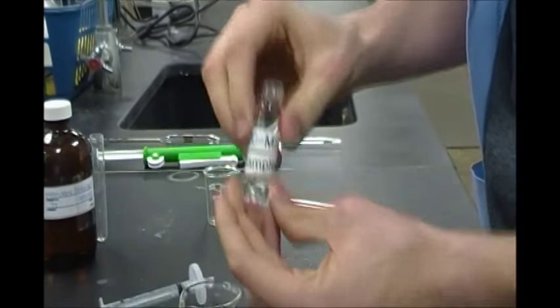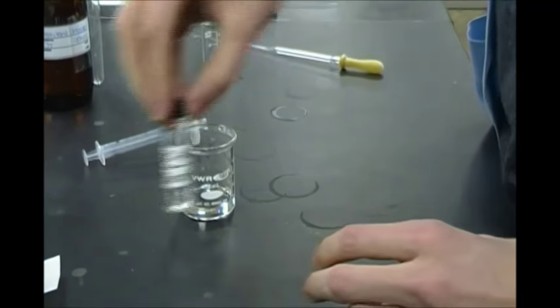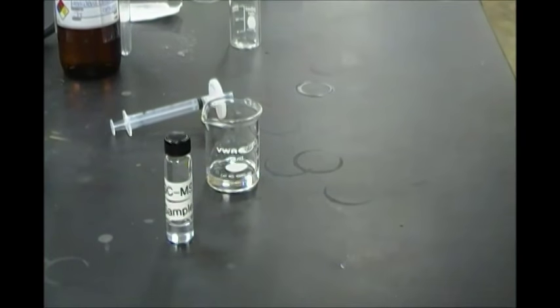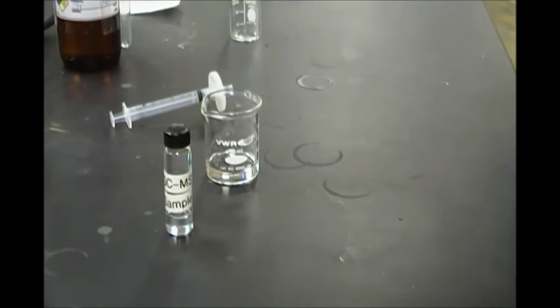Okay, so we filter our sample to remove any solid particles. Those solid particles can damage our GC, get stuck in the detector, get stuck in our column. It can cause a lot of bad problems for our GC mass spec.